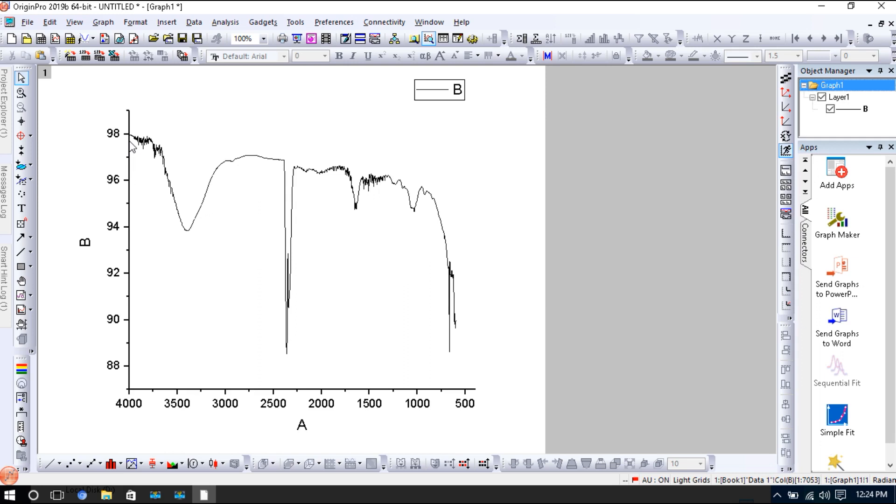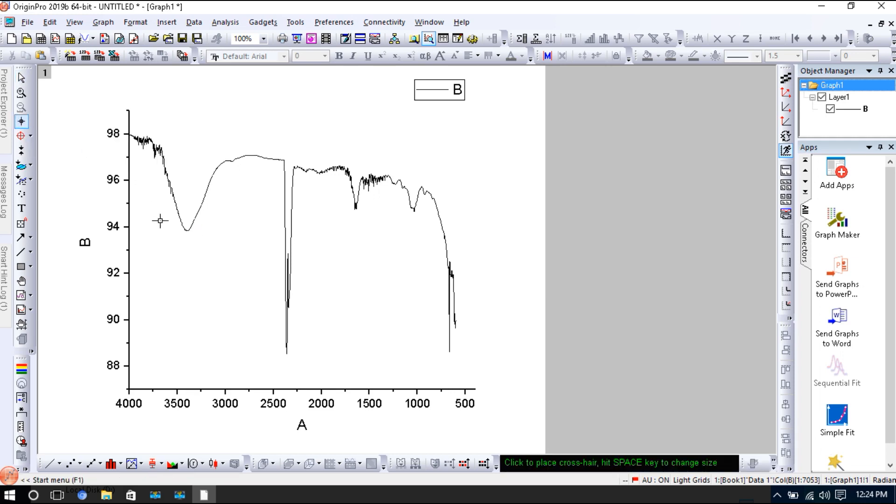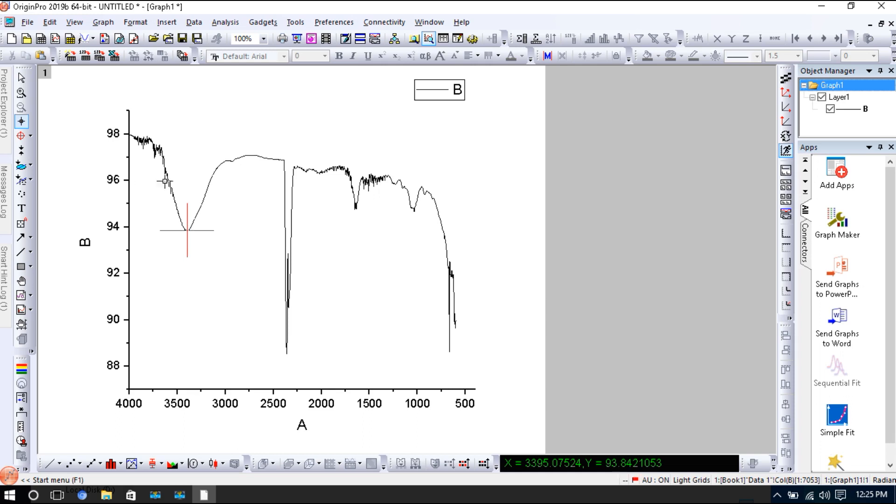If you want to understand what is the accurate region of this peak, then you will click this and just click on this. Look at here, there are two axes. This is Y-axis and this is X-axis. So we will take data. This is intensity and this is wavenumber.